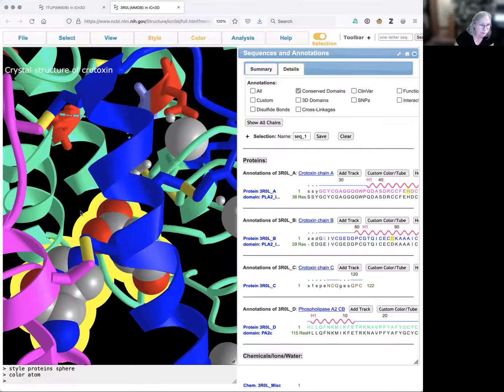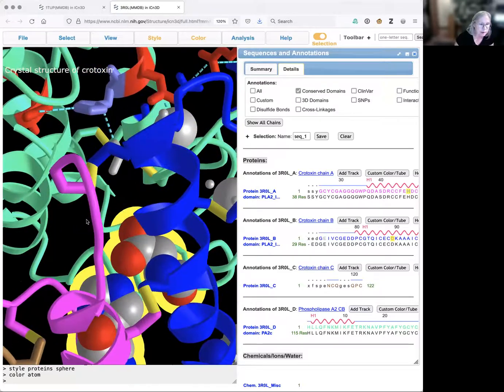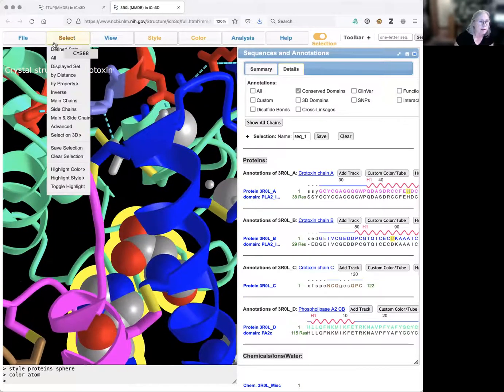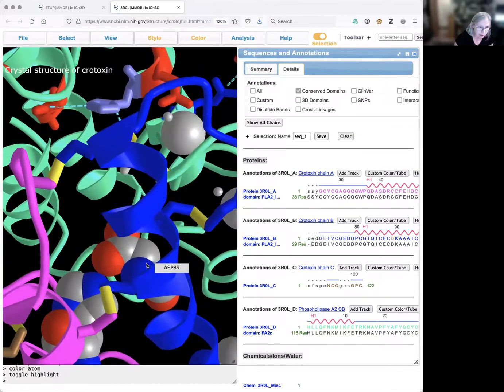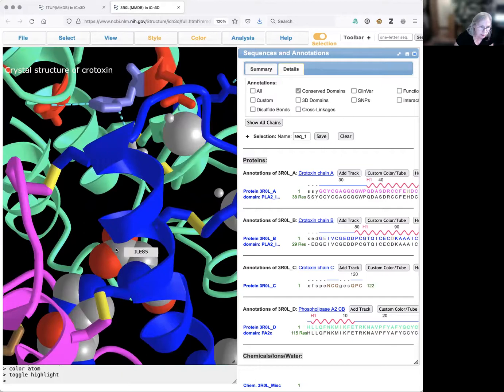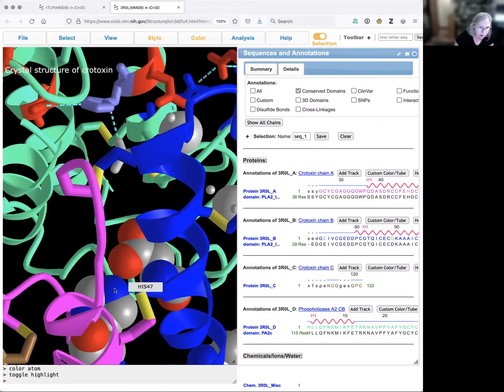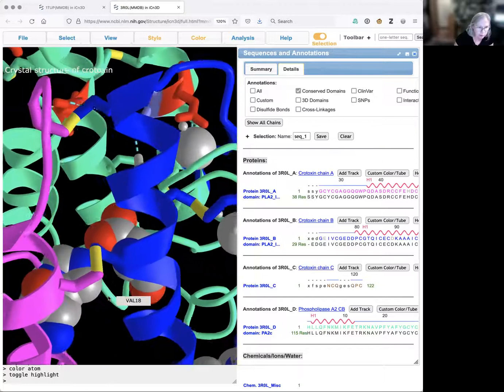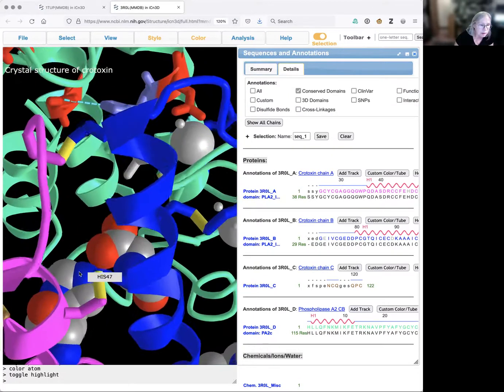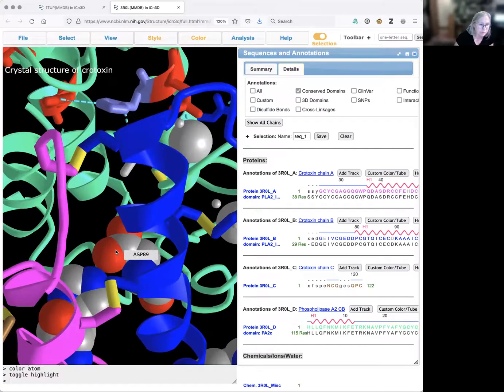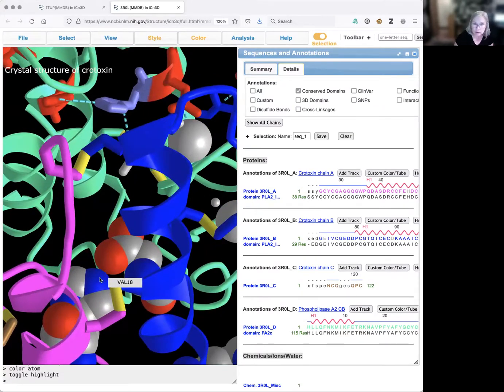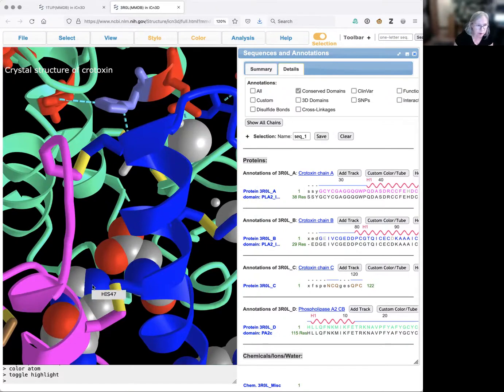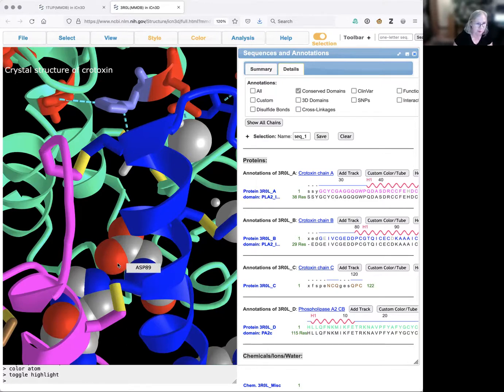We'll get rid of the highlight. Now what I can see is that my aspartic acid, I've got the carboxyl group here, and I can see the ring with the histidine. I can see that I've got one of the oxygens interacting with the nitrogen on the histidine ring. We know these nitrogens can have a positive charge. So that's another example of an ionic bond.